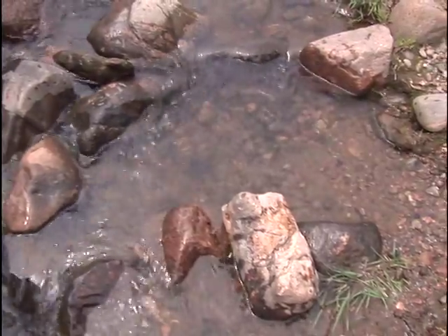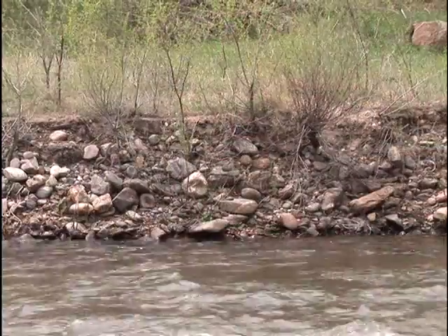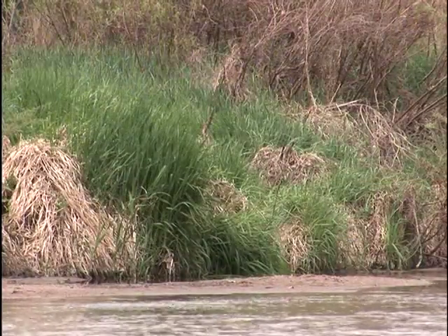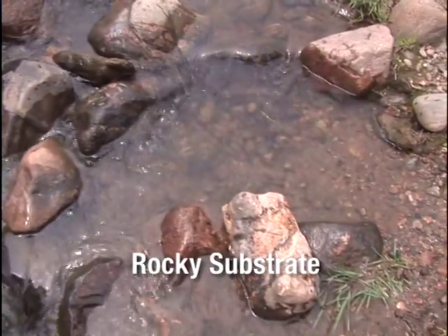Now that we have selected our sample location, we must determine if the river bottom, or substrate, is rocky or sandy. The river bottom type will determine what collection method we will use. When determining if your site is rocky or sandy, consider the following. Is your sample site covered by rocks and other hard-bottom substrate, or is it more sand and silt? If your site has more than 50% sand and silt, it is a sandy site. If your site is more than 50% rocky substrate, your site is rocky.